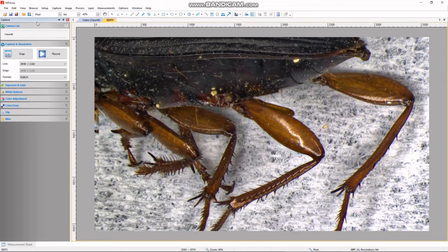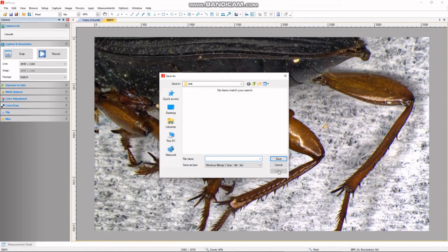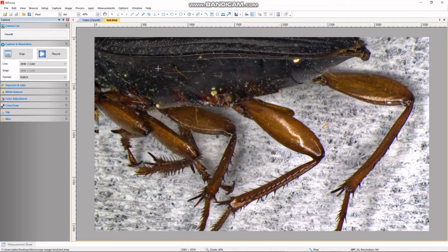From here we can then save the image. I have other videos on different ways to save, but you can click the save icon, choose where you want to capture it, name it, and it will be saved to your computer. That's the quick tutorial on how to do an extended depth of focus stitch in the In-Focus software.